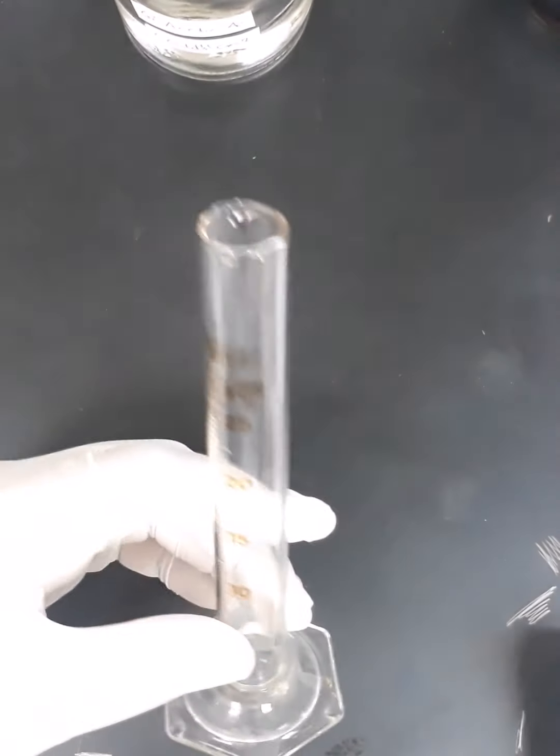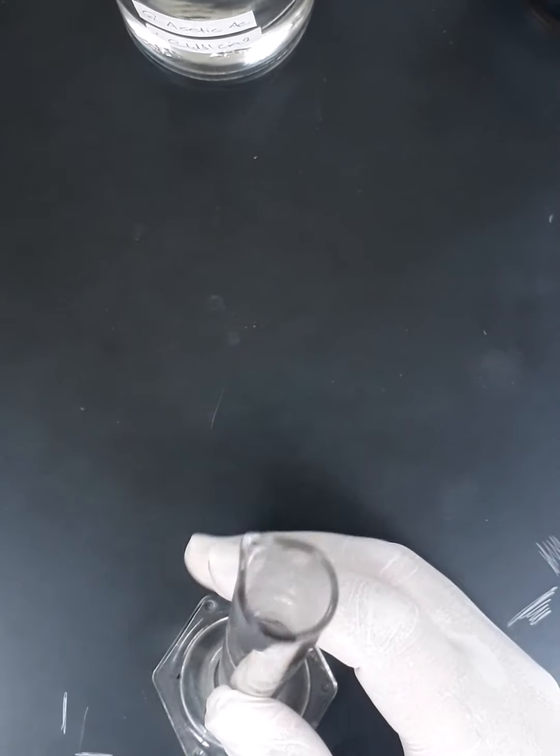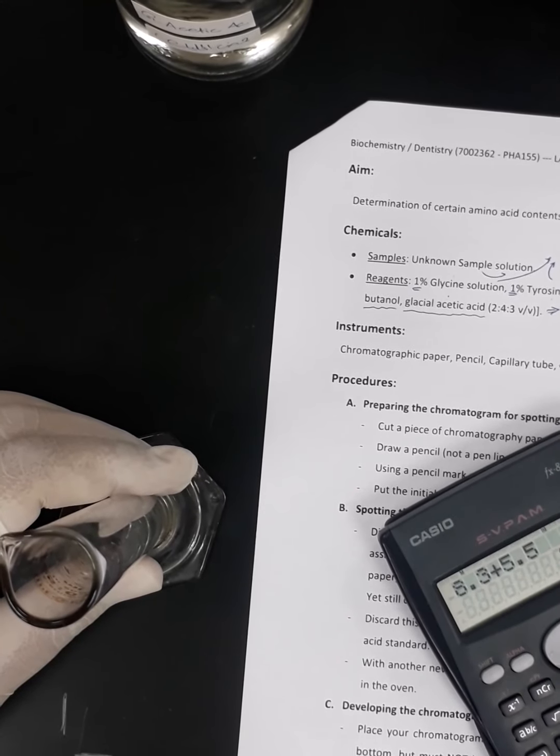I will take the measuring cylinder and I will add to that the total volume of water, which as we can see here, it is 5.5 milliliters. Then I'm going to add to that 11.11 milliliter of N-butanol and 8.3 milliliter of glacial acetic acid. So I will start by addition of glacial acetic acid, which is 8.3. So simply 8.3 plus 5.5, it would be 13.8.